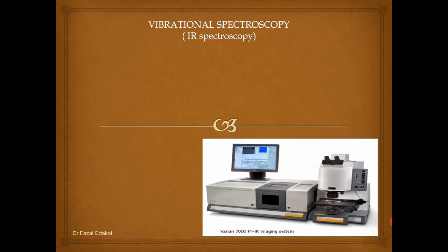If you wanted to identify an unknown molecule, you can't take just the NMR and predict the structure. What you really do is you get some information from nuclear magnetic resonance, proton NMR, C13 NMR.